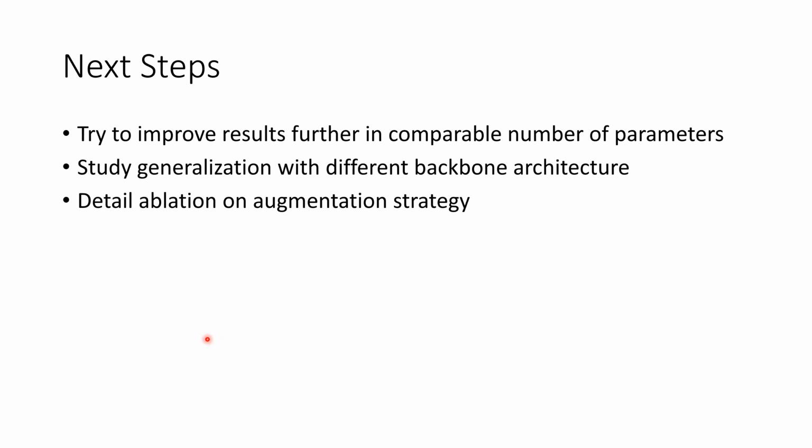Yeah, for the next steps, we will try to improve results further with a comparable number of parameters, since we still have room to increase the model capacity. We'll study how it generalizes with different backbones, and we will have a detailed ablation study on the augmentation strategy, because we played with many other things, for example the color jittering and scaling for field of view. So that's the plan for next.